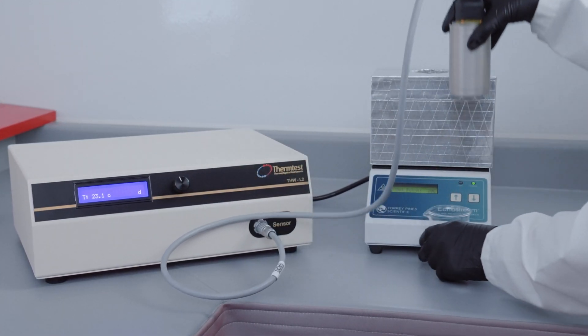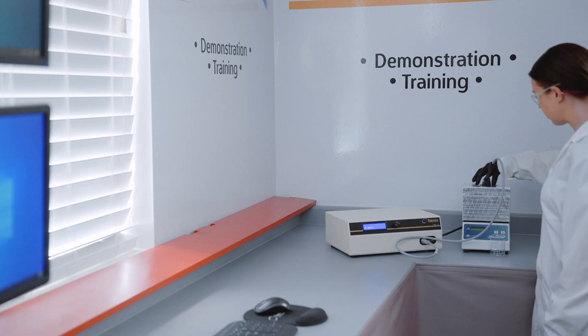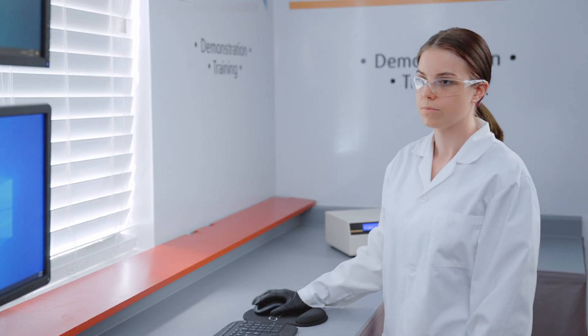With the optional thermoelectric dry bath, the THW L2 is capable of testing liquids over a temperature range of 0 to 100 degrees Celsius.